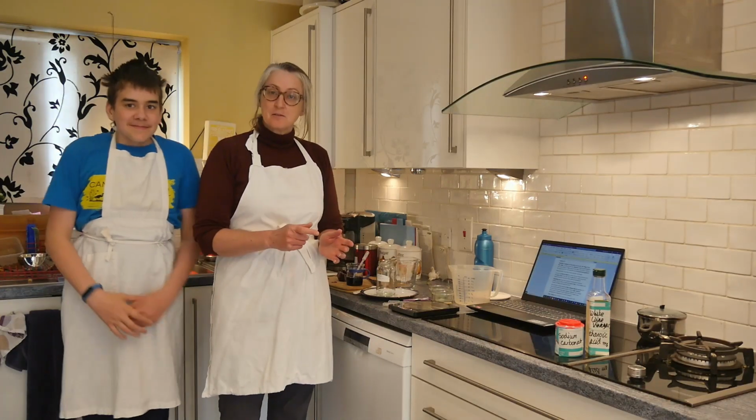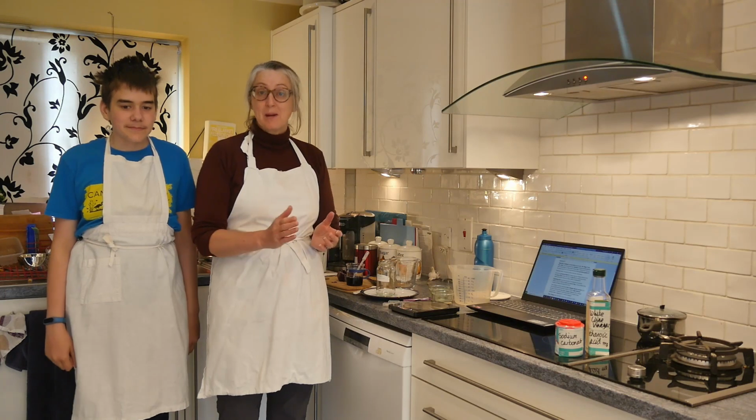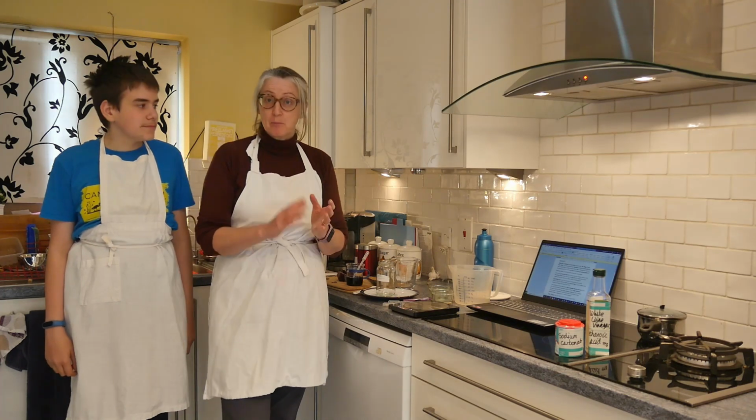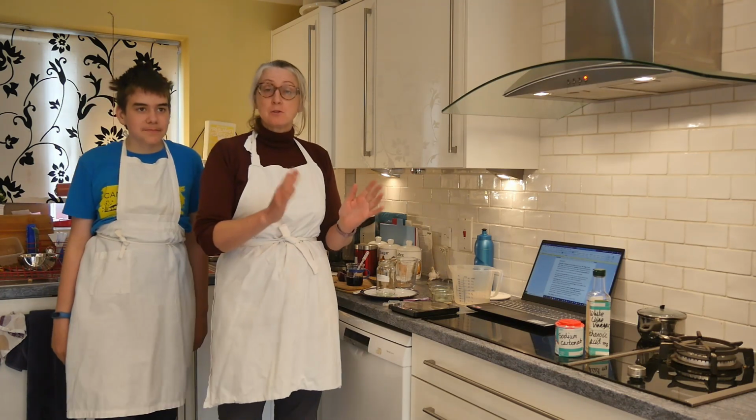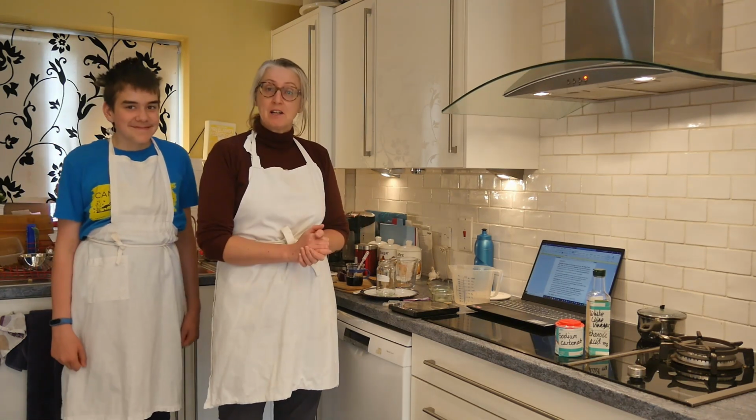In today's lesson, we're going to be looking at titrations. Now the problem is titration is a volumetric piece of chemistry work, and in order to do that you need to have accurate measurements. So we're going to measure as accurately as we can.